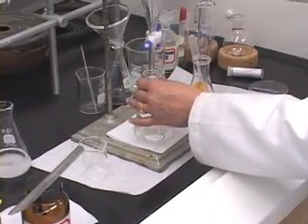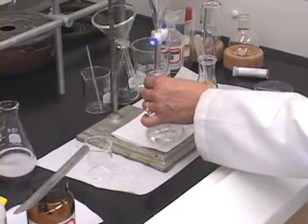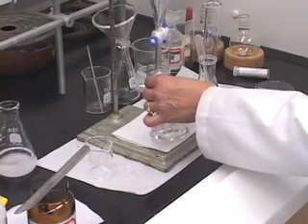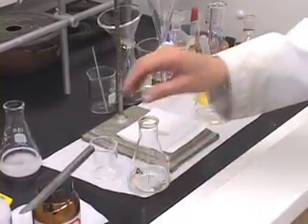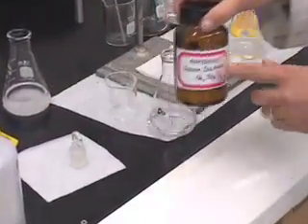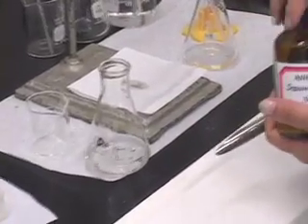Once everything is drained, take the Erlenmeyer flask out and add anhydrous sodium sulfate as we did before. Remember, just keep adding, swirling the flask.